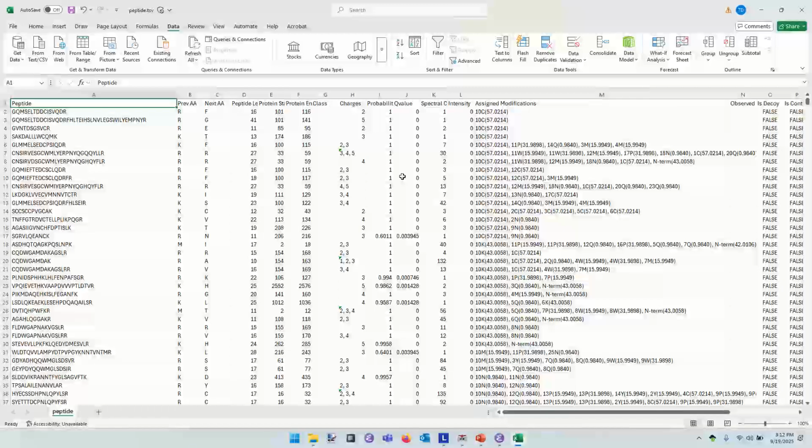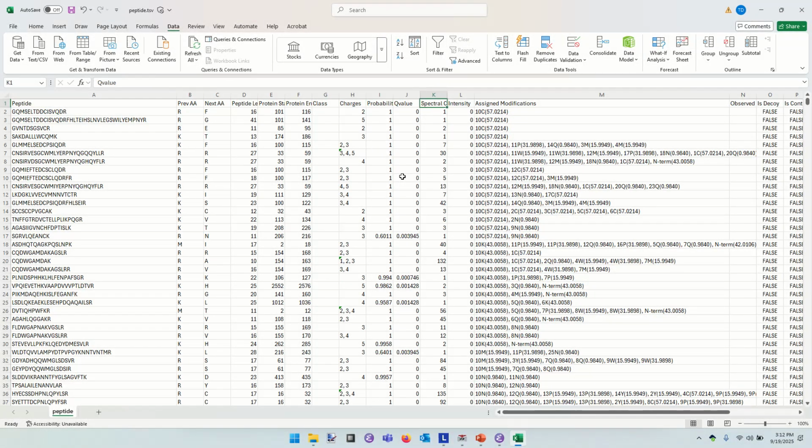Now, it would be a little difficult, if you ask me, to say how popular is any one PTM out of this mixture. So the kinds of plots I'm used to seeing for PTM output would have mass shifts on each column and an amino acid on each row, and then a count of how many PSMs contain each of these combinations.